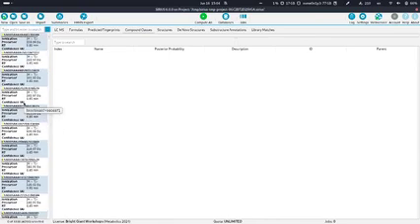Maybe just a few words about these lowest quality. So in principle, SIRIUS is detecting all the features, also things which are clearly not the real peak in the beginning. And usually you would then kick them out, like first pick all the features, make the alignment, and then decide that a lot of this stuff is probably noise.